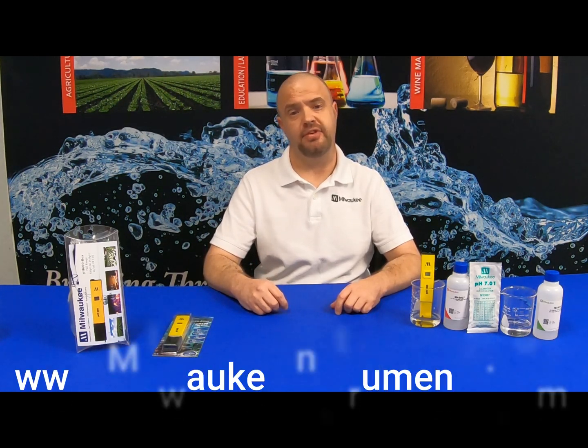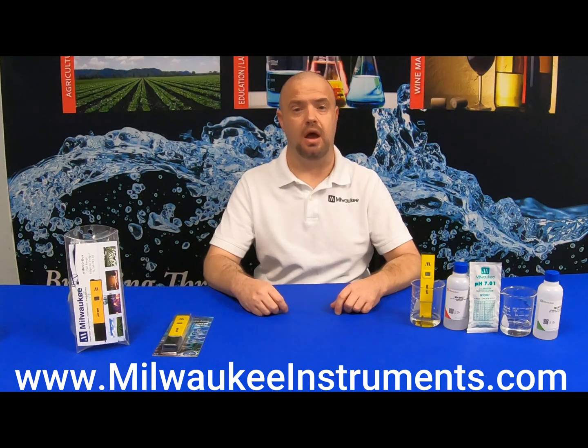For today, I will be demonstrating how to calibrate the Milwaukee Instruments PH600 pocket tester using 7 calibration solution. For additional calibration solution, storage solution, and cleaning solution, simply visit MilwaukeeInstruments.com.